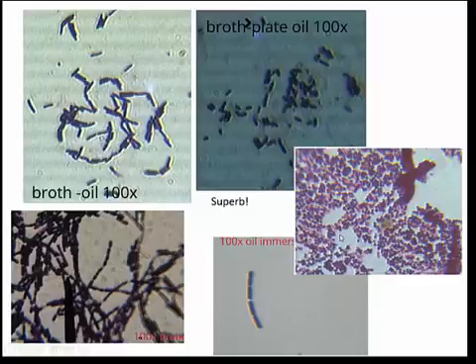And sometimes this is a Gram stain. Sometimes what you'll see is that some are purple and some are red, right? You really only want one. You want it to be purple or you want it to be pink. But look, you guys are just starting out, right? I understand that. So if I see something that's not perfect, but the quality of the image is good, you're right on there, and I'm very pleased with this.